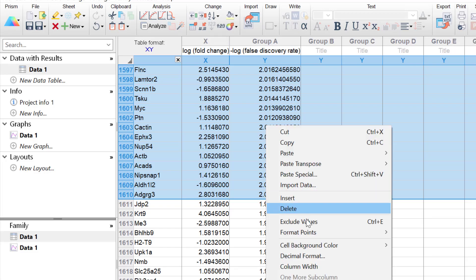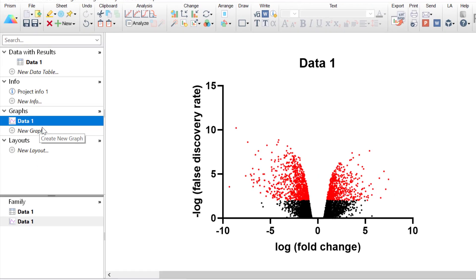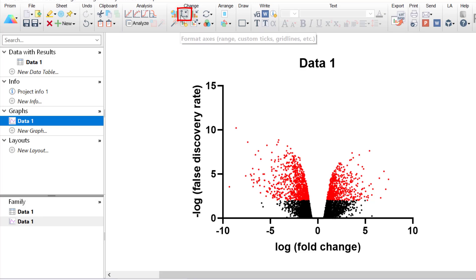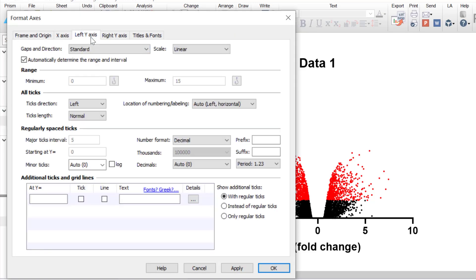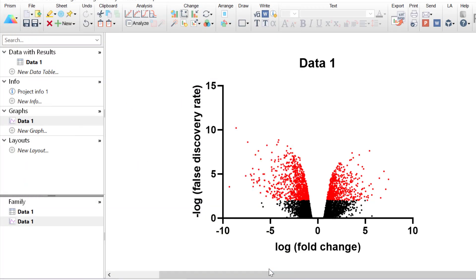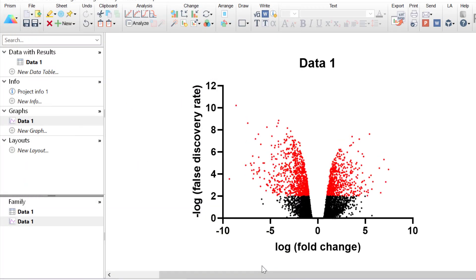You can also right-click and go to Format Points, then Symbol Colour, to change the colour from there. Going back to the graph sheet, notice that all data points above the threshold — a y value of 2 — are now coloured red. Next, I'll tweak the y-axis by going to the Format Axes button, selecting the left y-axis tab, and changing the range: I'll set the maximum value to 12 and change the major tick interval from 5 to 2, so every two points on the y-axis will be labelled. Clicking OK, the y-axis is now reduced slightly and makes better use of the white space.